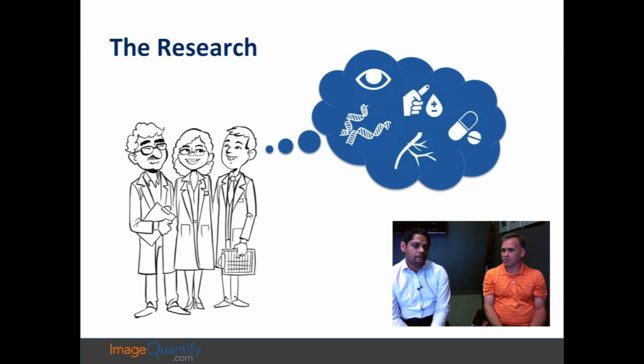Usually, some people are often using it just to check that they don't have a phenotype in the eye. If you've got an animal and you're pretty sure that it doesn't have any sort of issues with the eye, you do a quick scan to make sure and confirm it. So it's as much a rule out as a rule in kind of thing? Right. Is that only used for people who are doing genomic work or something like that? Generally, yeah. Okay, that makes sense. That's super cool.